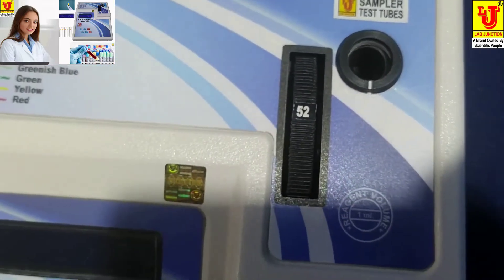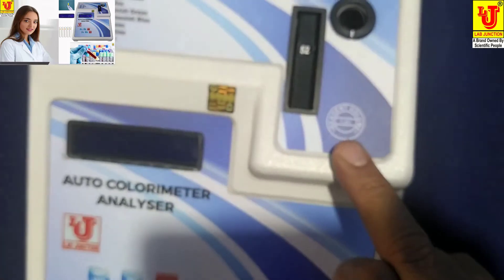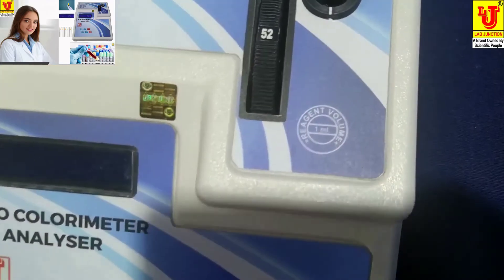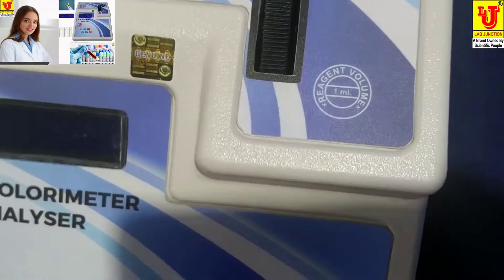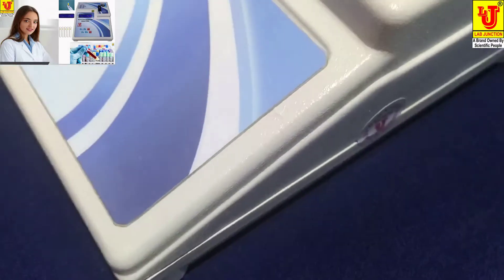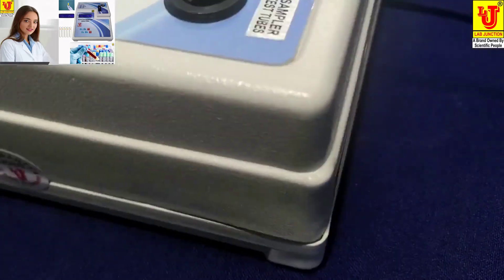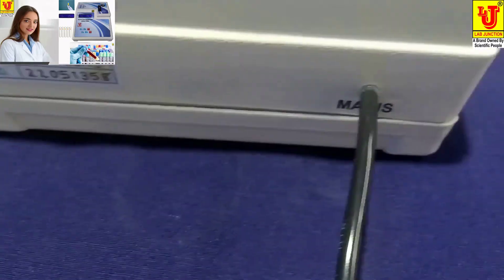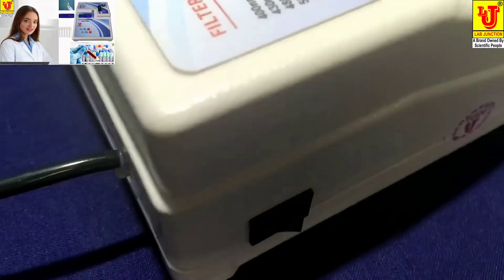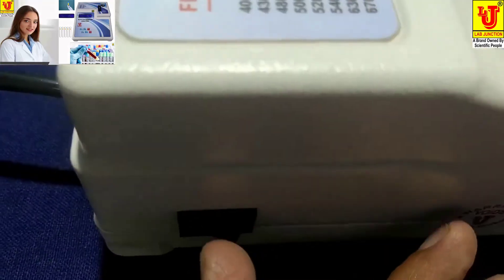In the test tube, the minimum reagent volume is 1 ml. Now the side view — these are the side views — and the back view. In this side view, there is an on/off switch facility.